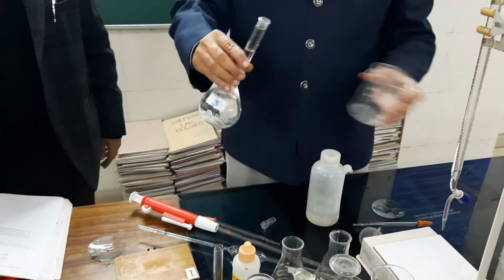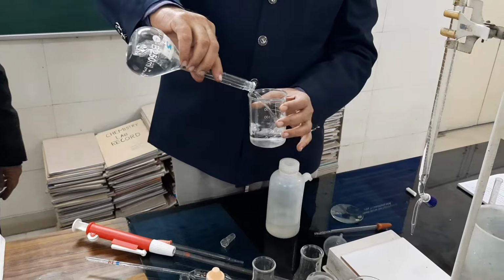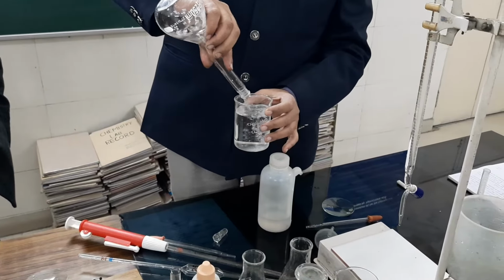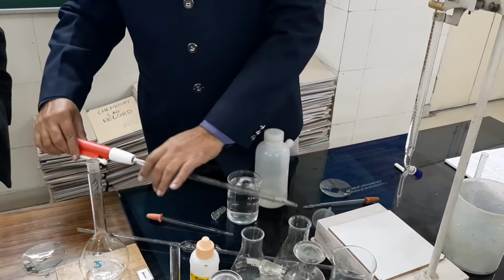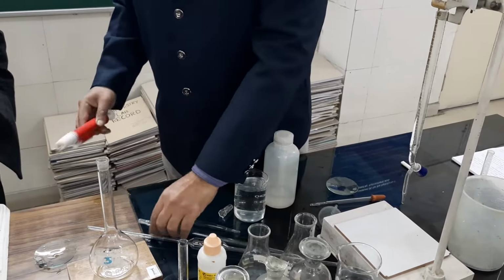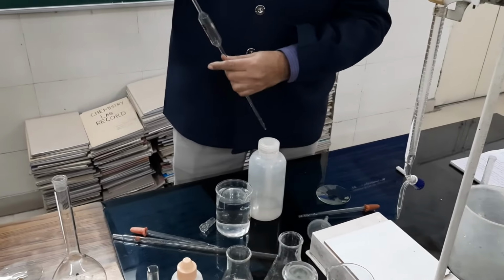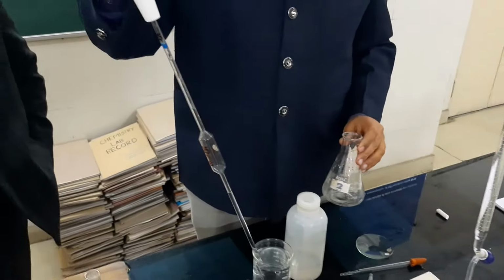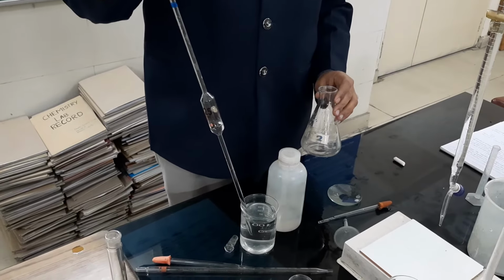Now transfer 25 ml of this solution into a washed conical flask with the help of a pipette of 25 ml capacity.